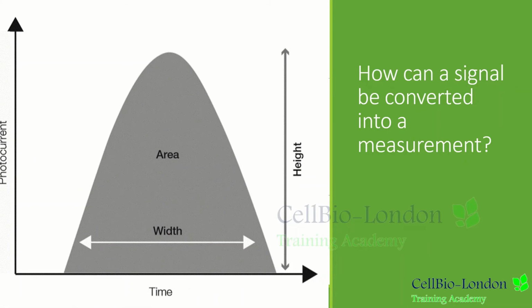When a particle passes through the interrogation point, it generates a signal which is detected as a pulse, known as an event, in every detector. These pulses reflect the passage of the particle through the laser beam or beams, and the signal generated at each point in the cell's path. These pulses can be mapped by plotting signal as a function of time.